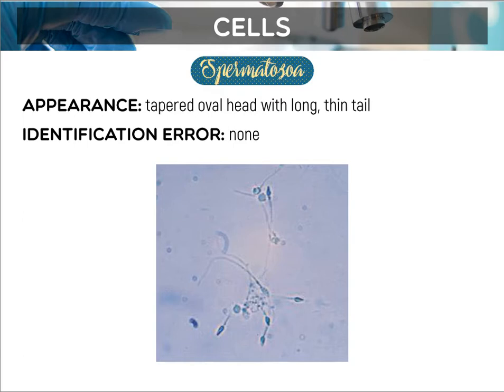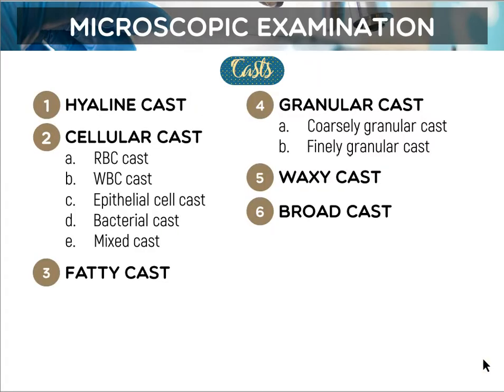Okay? So, urine is toxic to sperm. Therefore, they rarely exhibit motility. So, when you look at the prepared urine, you will see that they are no longer moving, or the sperms only have restricted movement. Okay? Alright, so much for that.